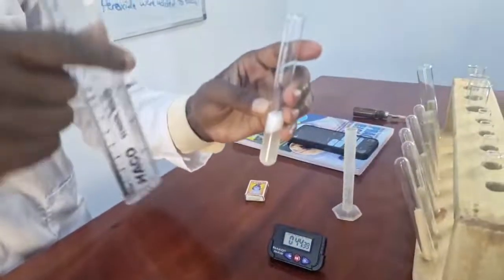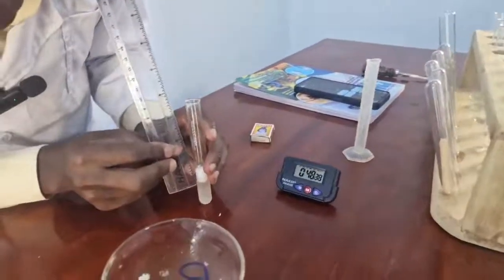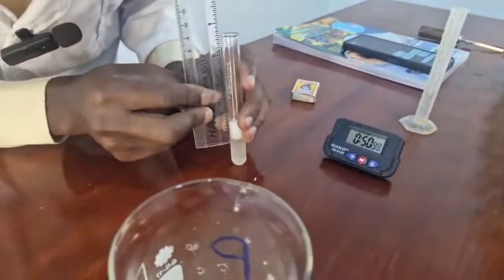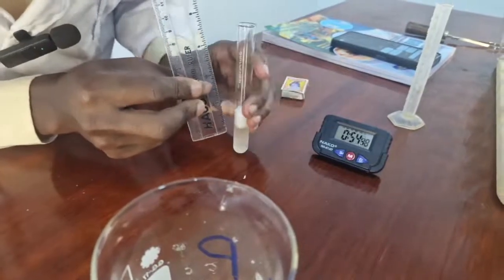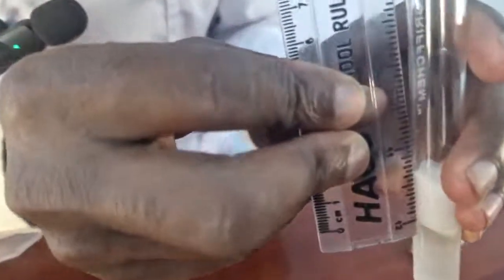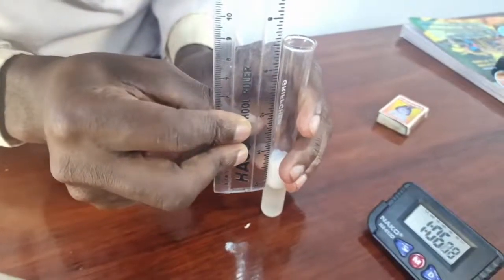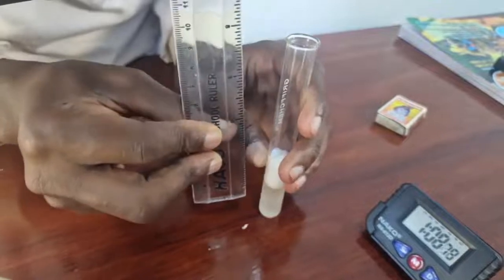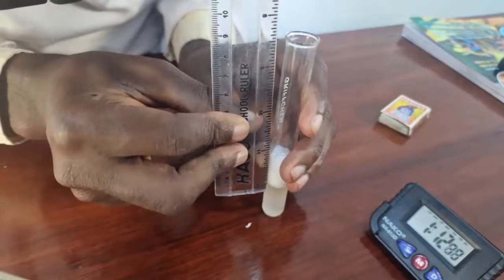I'll measure the length from the top of the solution. Let's measure it together. Let me put it on a flat table such that I don't slant it. The length from where I'm holding to where it is.